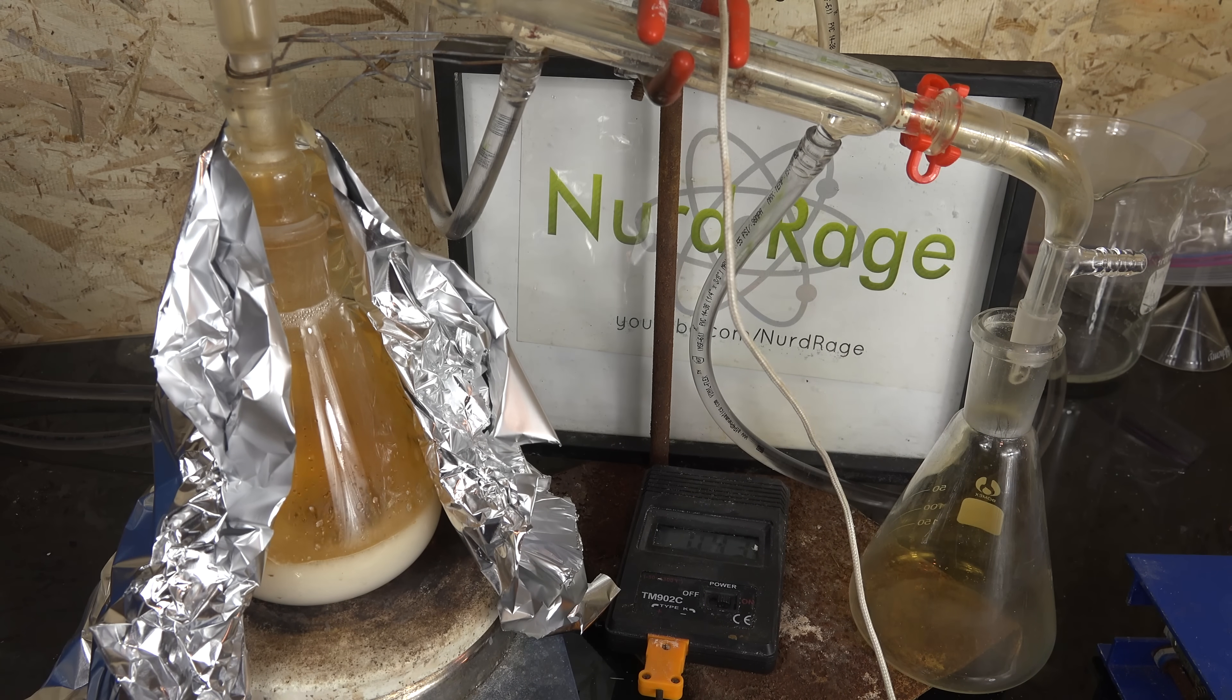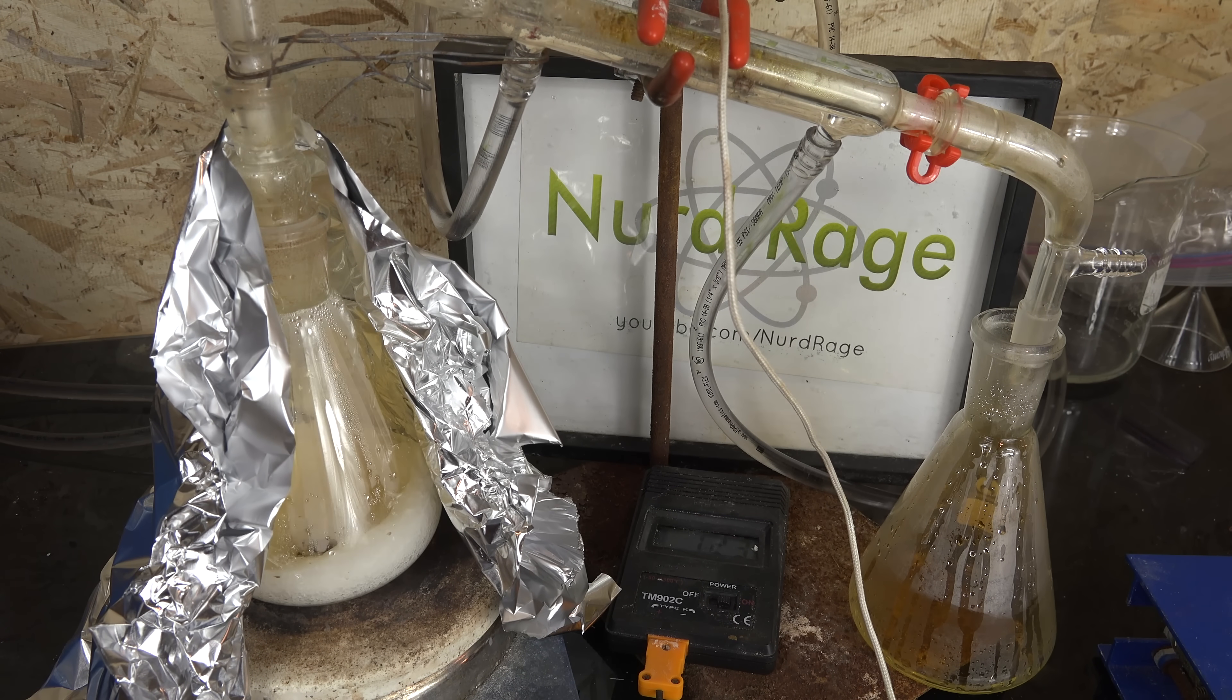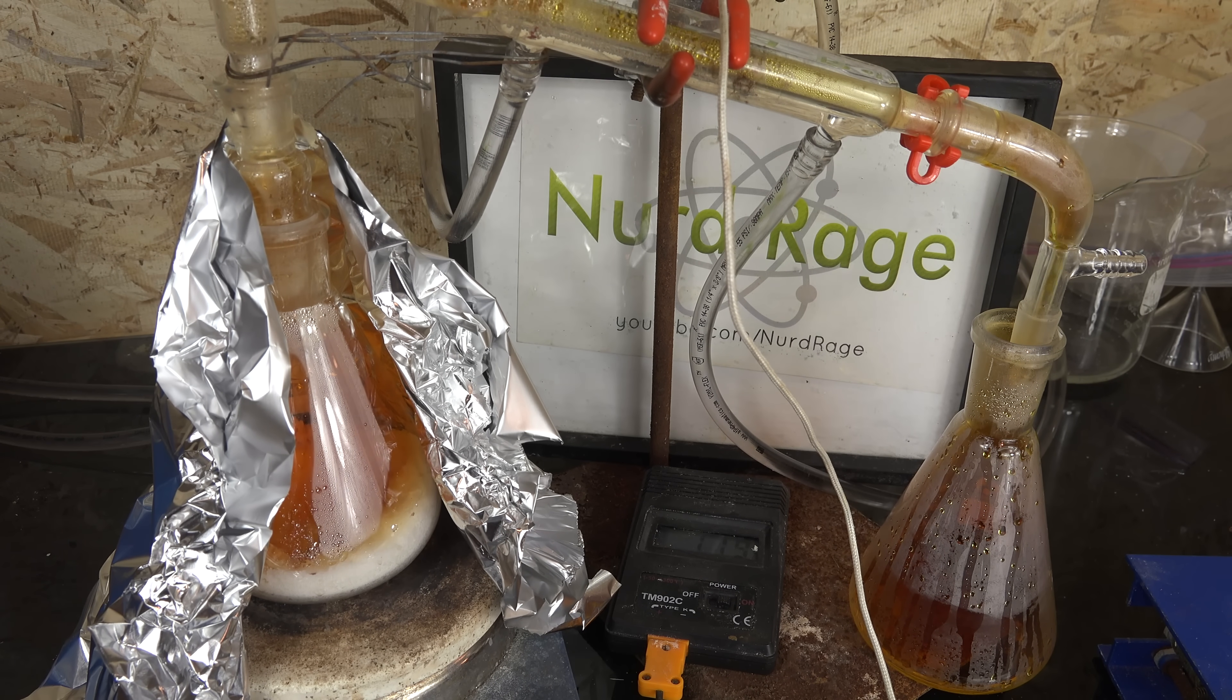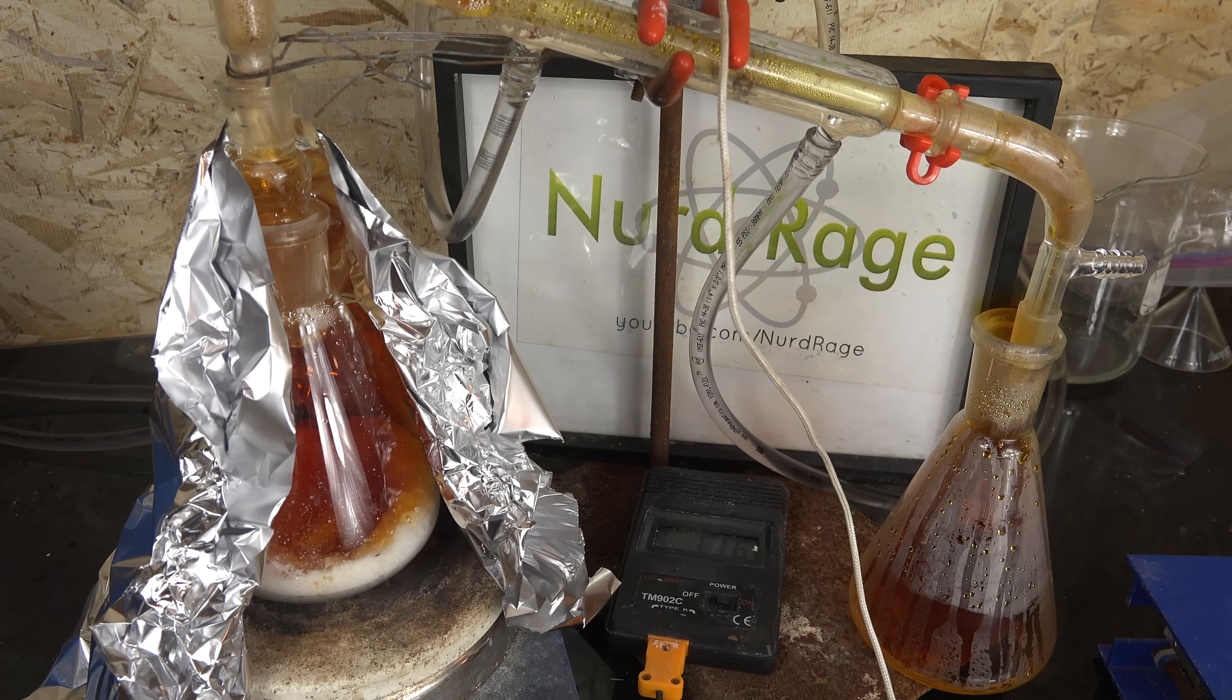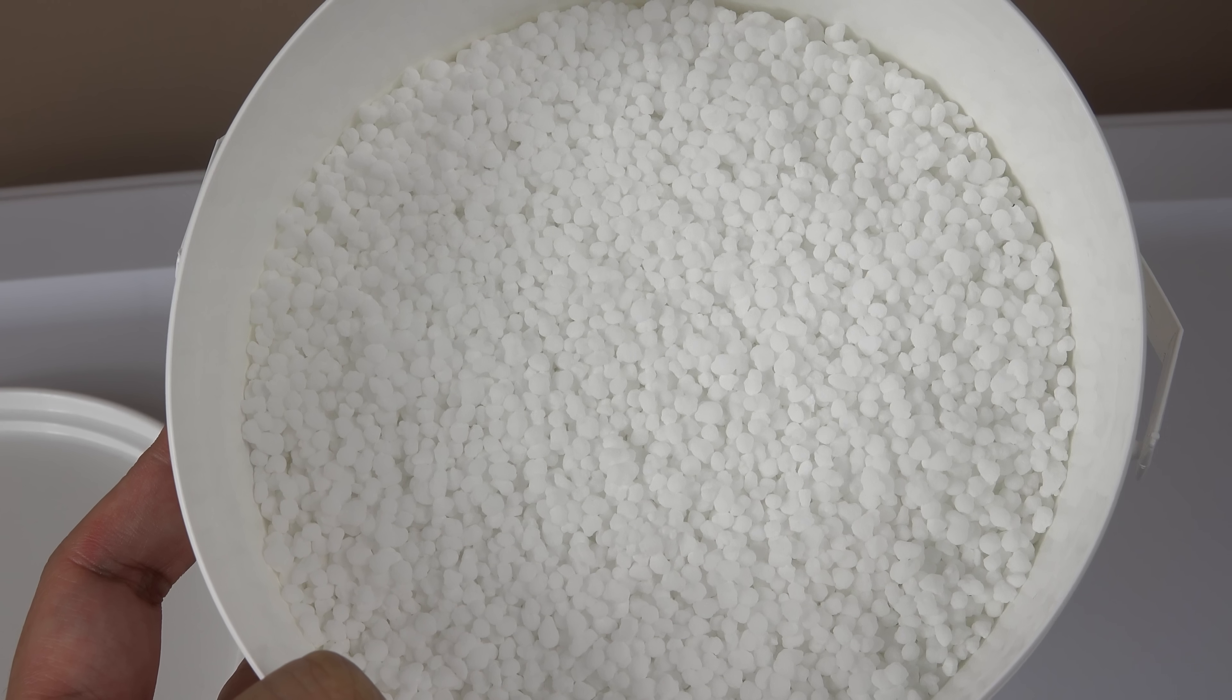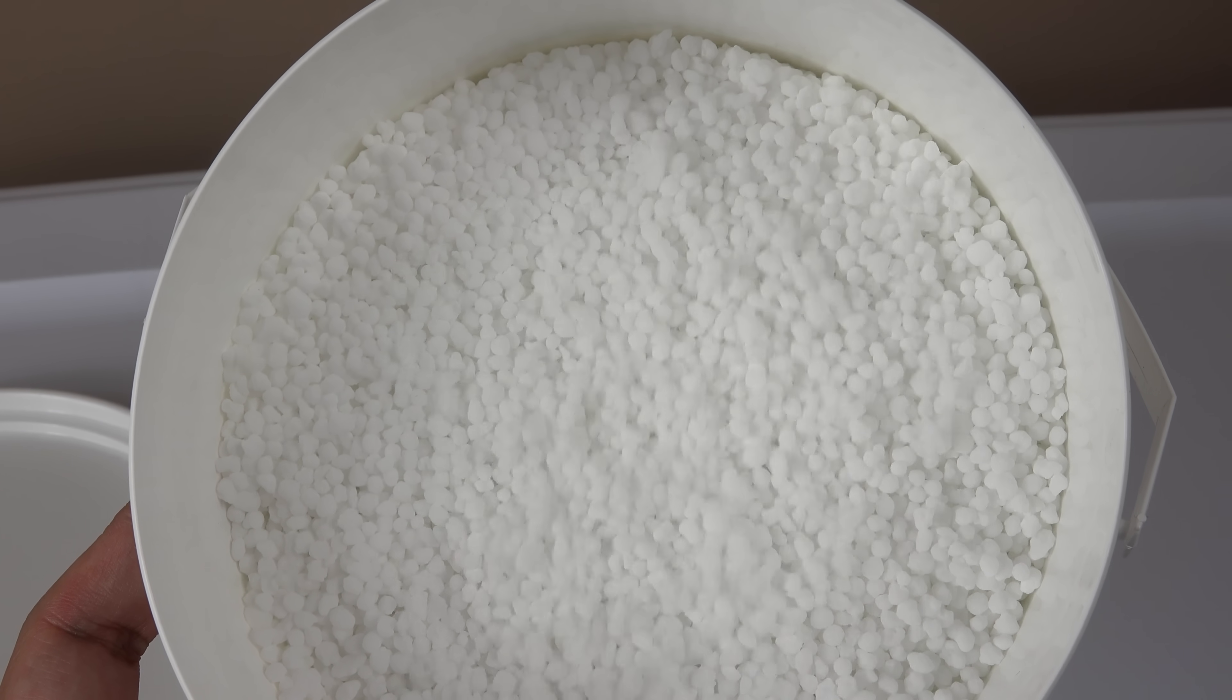The first thing I was working on was nitric acid. In a previous video I made nitric acid using sodium nitrate and sodium bisulfate. The advantage of this process being that it didn't use sulfuric acid, which is available to some amateurs but not to others. Now one important question that came up is how sodium bisulfate reacts with calcium nitrate. Calcium nitrate and calcium ammonium nitrate are somewhat easier to obtain than sodium nitrate and potassium nitrate. So there is some interest in the amateur community to use them for making nitric acid.